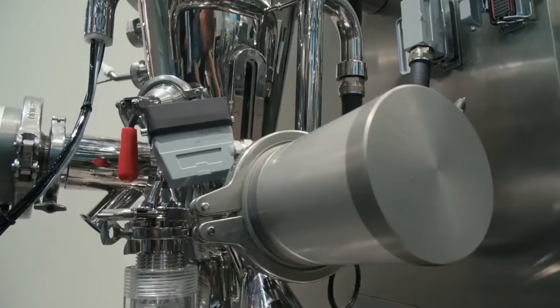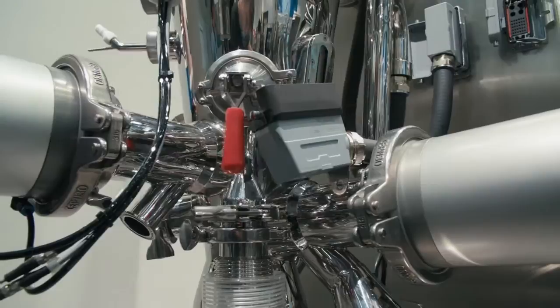The AirConnect system is a fluidized bed processor that gives the capability of carrying out drying processes, granulation processes, and coating processes. We offer several different systems on there. Our key system is our FlexStream system, specifically for granulation and coating processes.